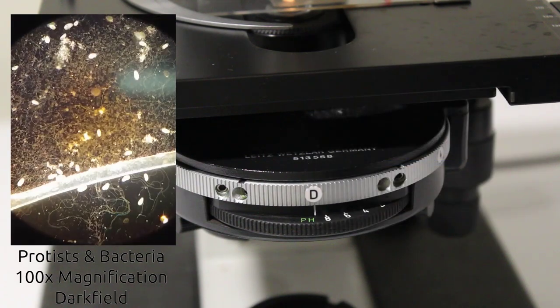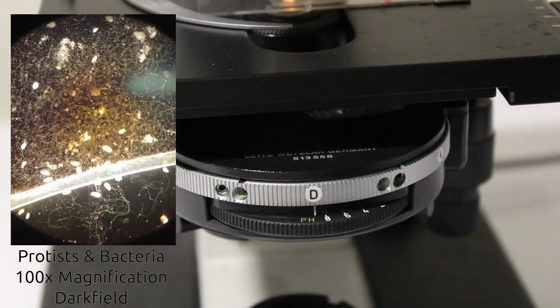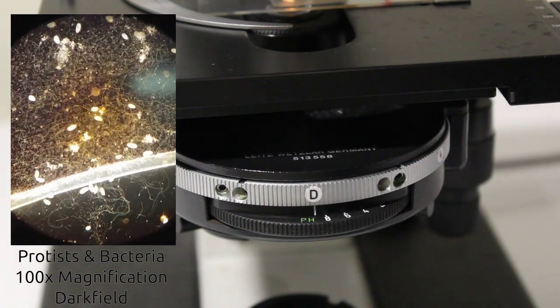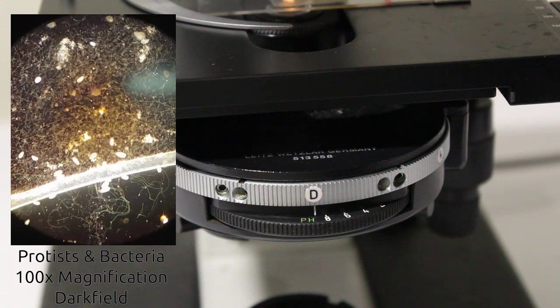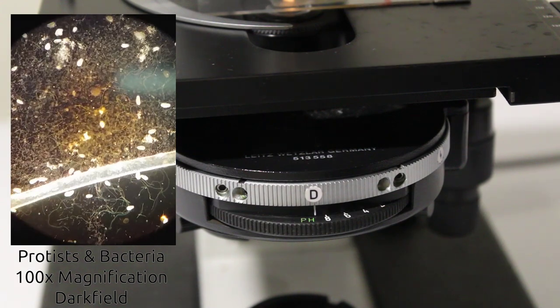Because of this we get really good contrast and it's really easy to see cells but unfortunately it only works at low magnification so it doesn't have much of a use in the brewery.